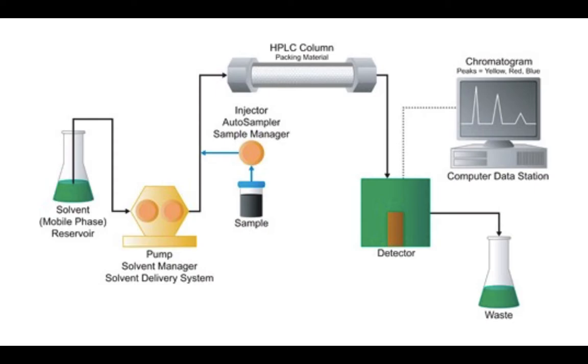The main components of an HPLC system include the solvent reservoirs, which hold the mobile phase. There are usually a minimum of 2, fitted with a gas diffuser. A high-pressure pump, which is used to generate a specific flow of the mobile phase. A column, which is packed with the stationary phase, and an injector system, either manual or automated depending on the system, and the detector.